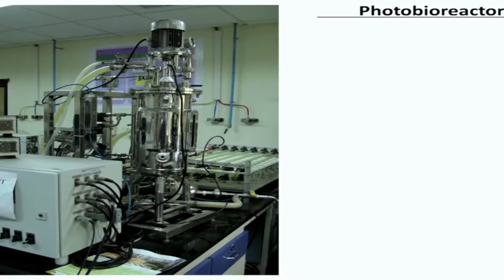The next kind of bioreactor that I would like to talk about is called a photobioreactor. A photobioreactor means that it employs light. When do we need light? Whenever an organism needs light, and something that requires light is called a photosynthetic organism. When you use photosynthetic organisms, you need to use something called a photobioreactor.